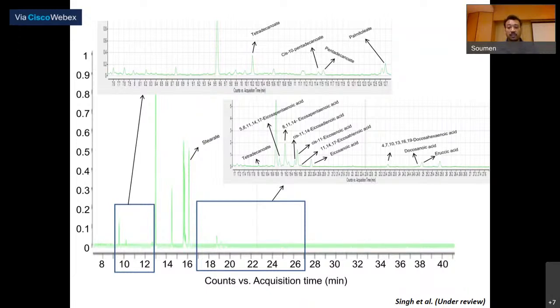You can do a simple GCMS matching, like we have with a library, and you can compare your fragmentation pattern with the library-reported electron impact ionization spectra. You can also match the retention time if you have an authentic standard, and that would be the final nail in the coffin of identification.